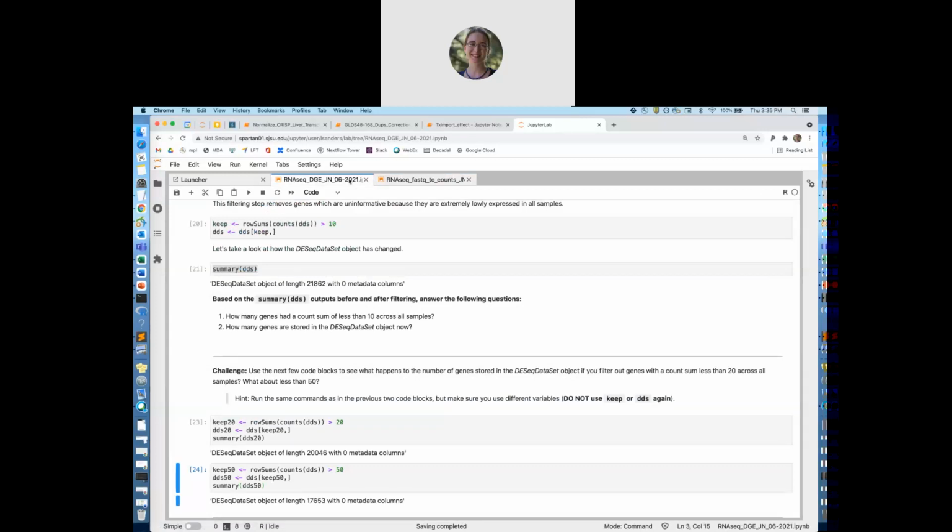Mine's giving 17,653 for 10, 20, and 50. Christina, I wonder if you overwrote one of your variables. Would you mind sharing the code that you're using?